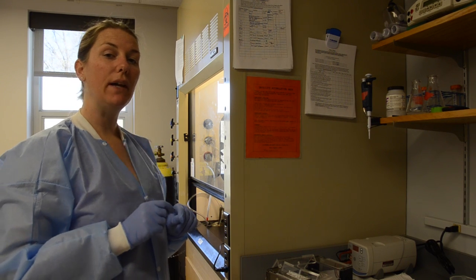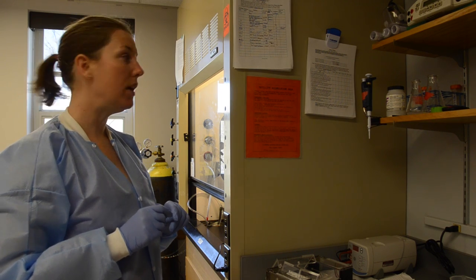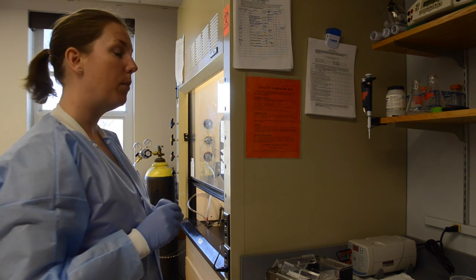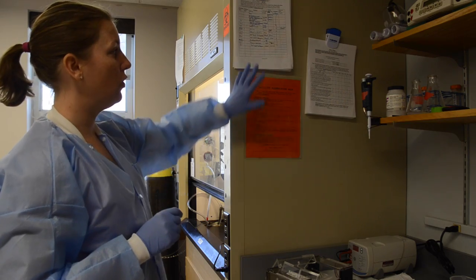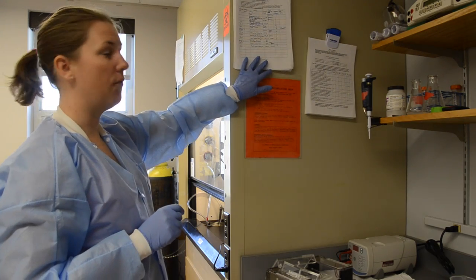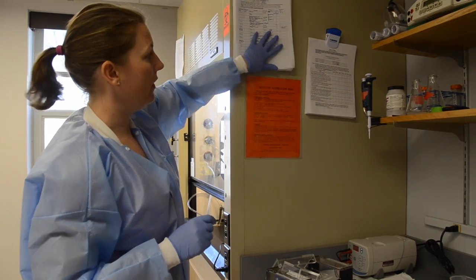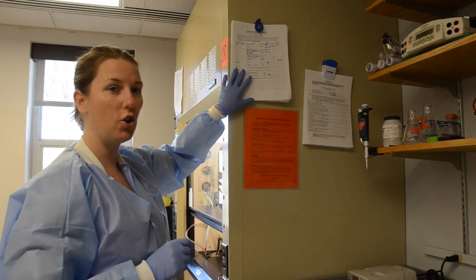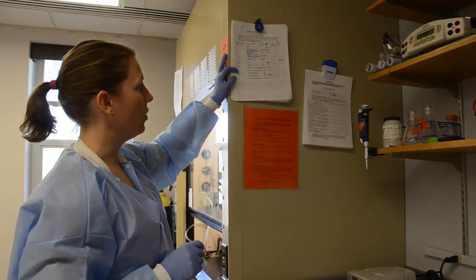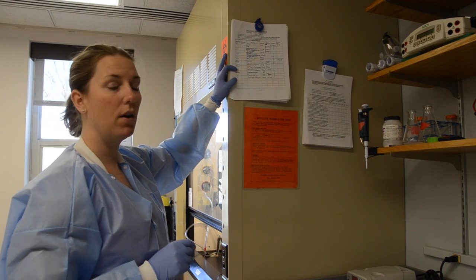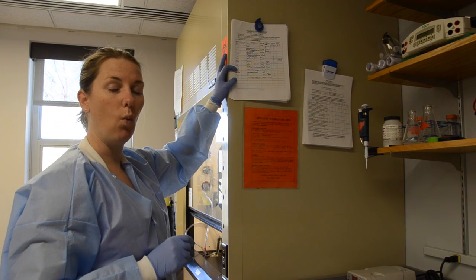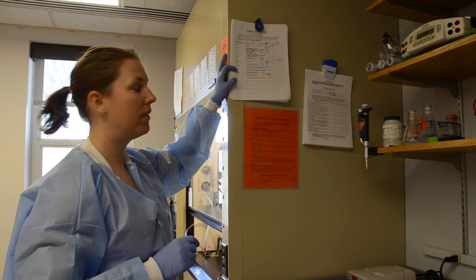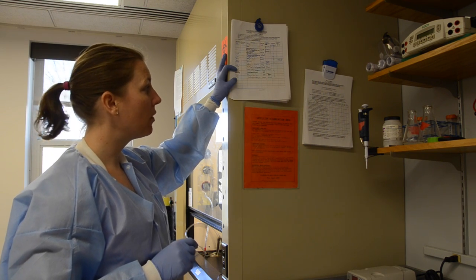Today we're going to talk about hood and chemical safety. One of the most important things is to start with the forms. On the side of the hood here we have a hazardous waste log sheet. This is where you mark when you are adding waste to our satellite accumulation area.